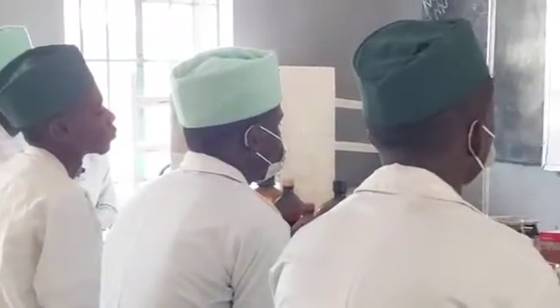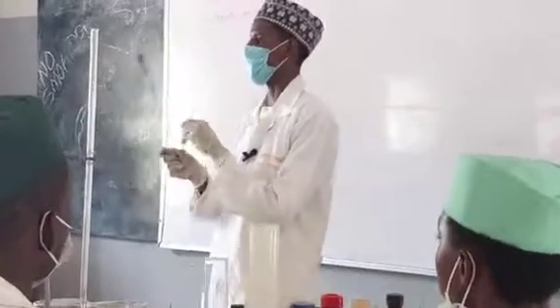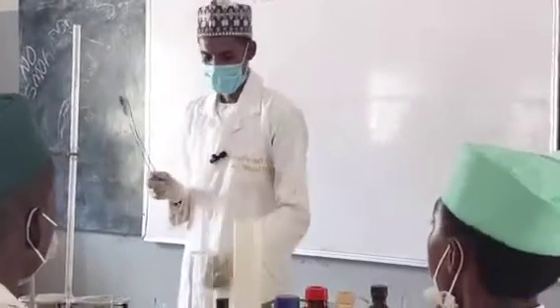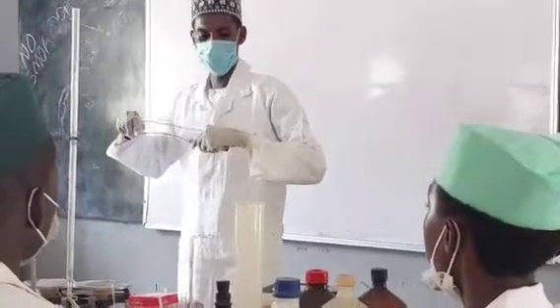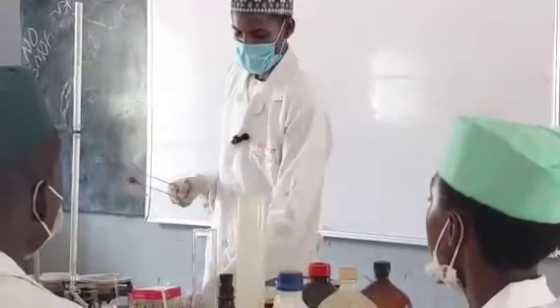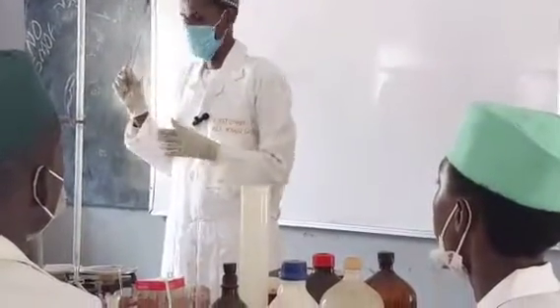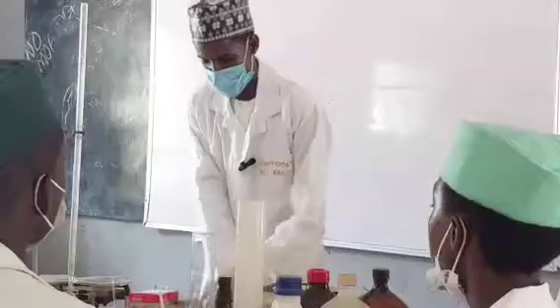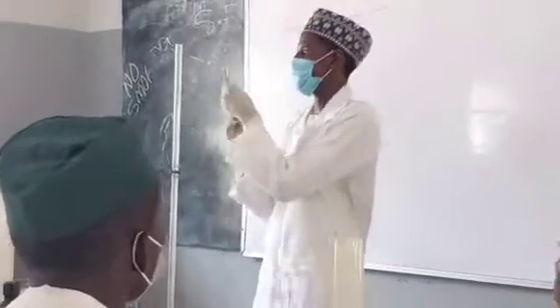It depends on the volume. This is our brush for washing the test tube and many others. You don't use your hand to rinse it. No, you use the brush. This is called the tongs.